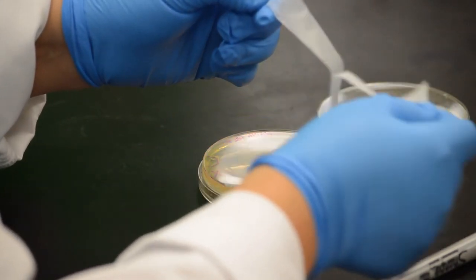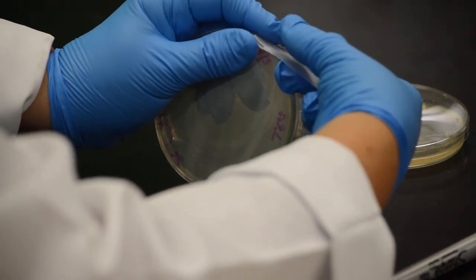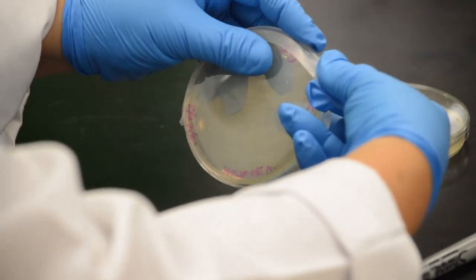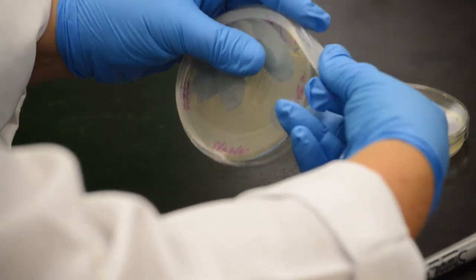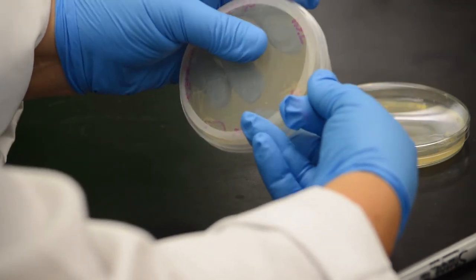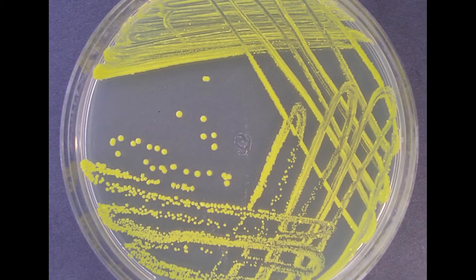Seal the plate with a strip of parafilm. Store the plate upside down, in an inverted position, in the container for your lab section. Why upside down? Bacteria respire, and with respiration, water is released. If the petri plate is stored lid up, condensation will develop and raindrops will form on your plate. The free water will then allow the bacteria to spread over the plate, and thus no isolated colonies will form.